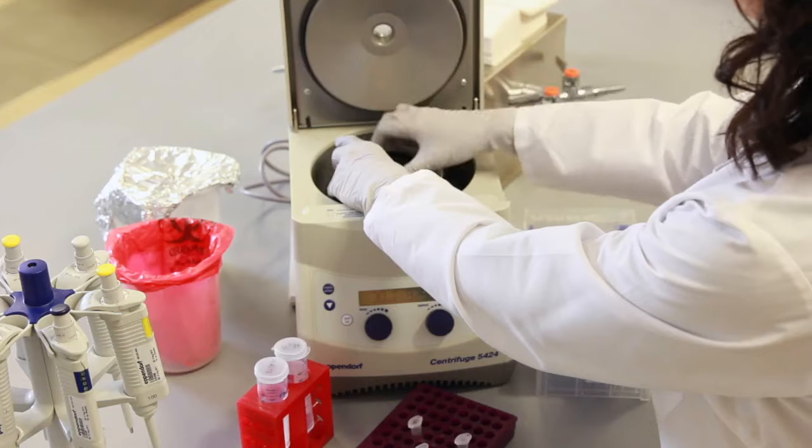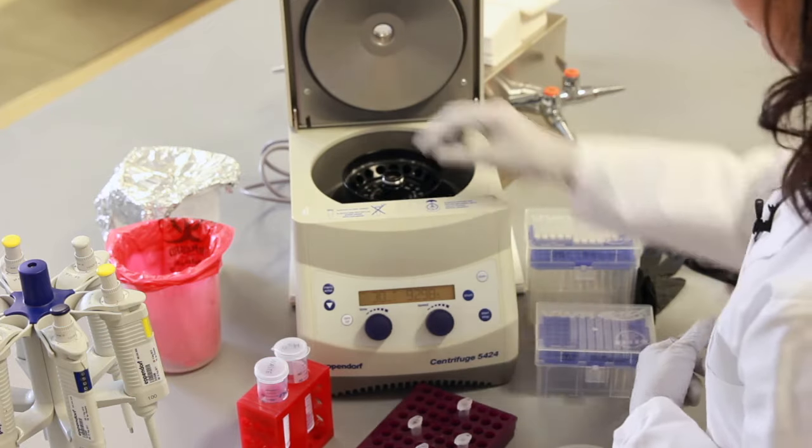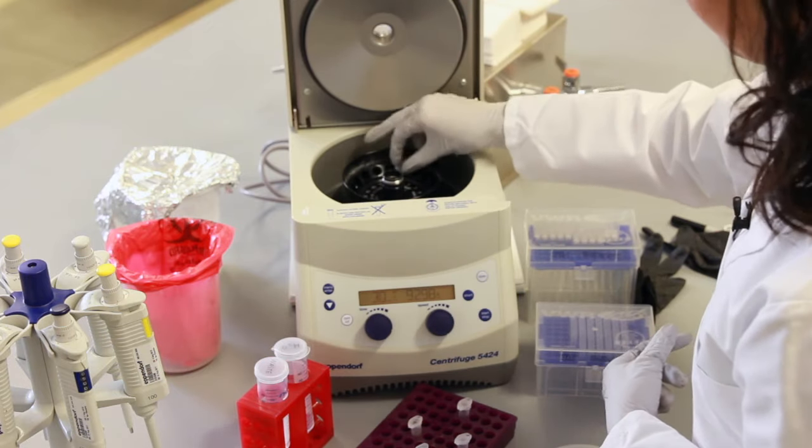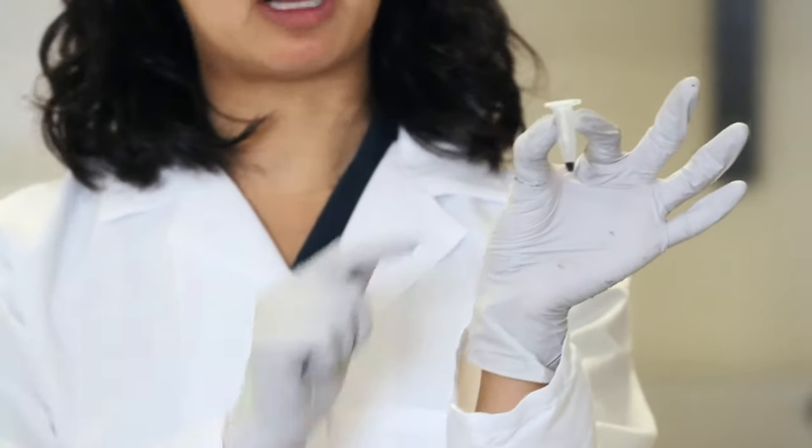When my centrifuge finishes running, you'll see that first I have my blank, which is still there, and then my sample has all collected at the bottom of the tube. There's no more blue on any of the surrounding areas of the tube, and this is exactly what I'm looking for.